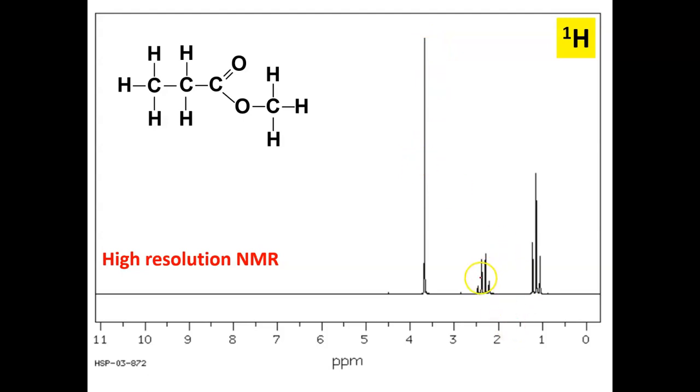This multiple pattern that you can see is called peak splitting, and this is something which we will go into later on. Its proper name is spin-spin coupling, and it's basically how the magnetic field of one type of proton influences the magnetic field of others nearby.